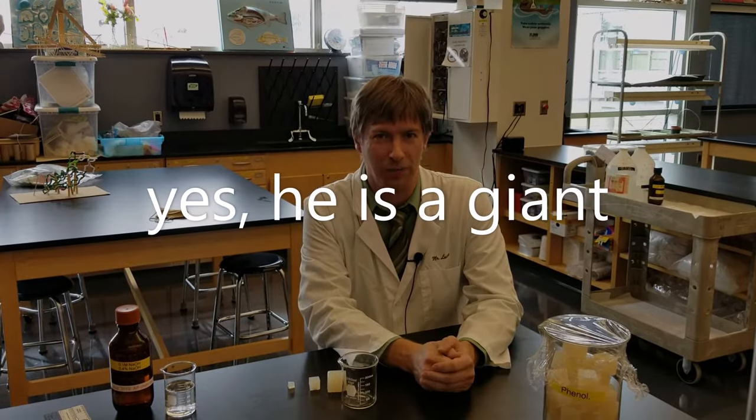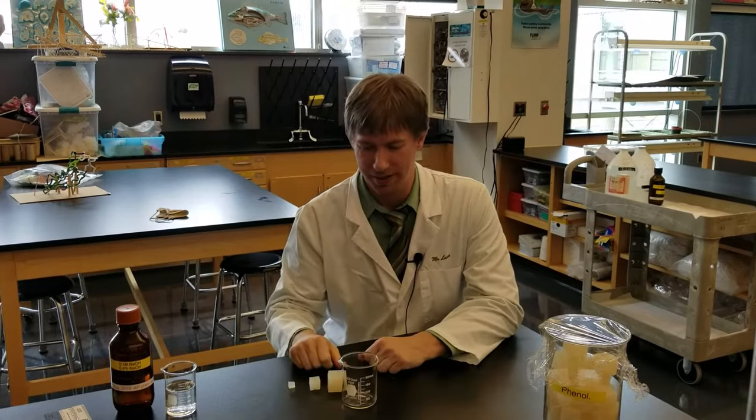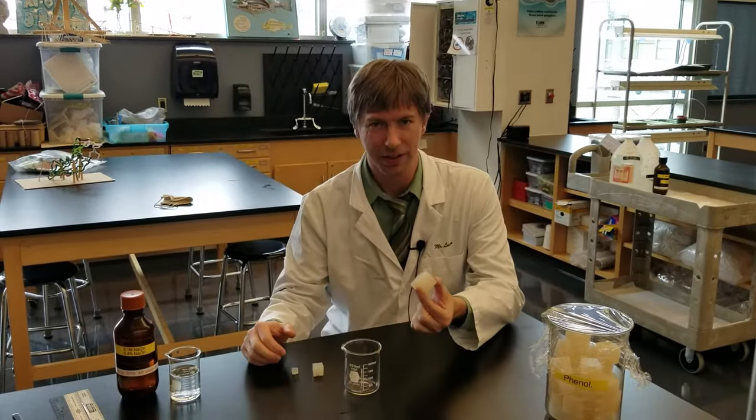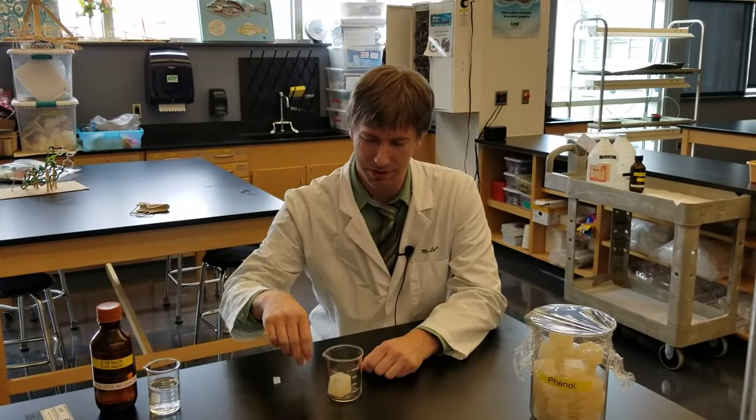Hi, Lucas here. They made me sit down because I'm kind of tall and wasn't being caught by the camera. So we're going to take the data on this part right now. These are the three phenolphthalein cubes, and I'm going to put them all in the same beaker — one, two, three.